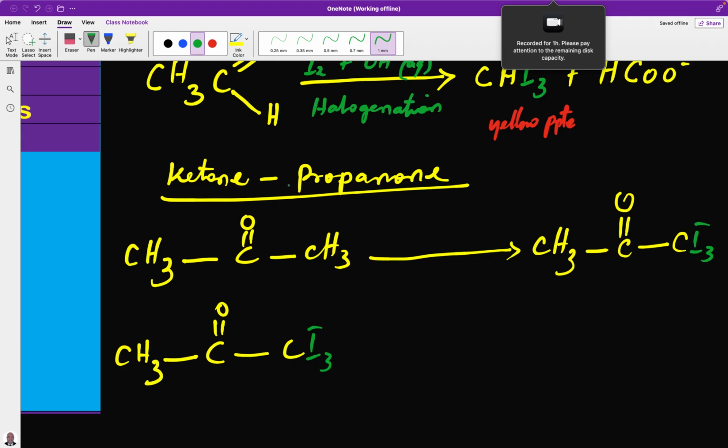There is hydrolysis to take place. And what will form? During the hydrolysis, this is what happened here.